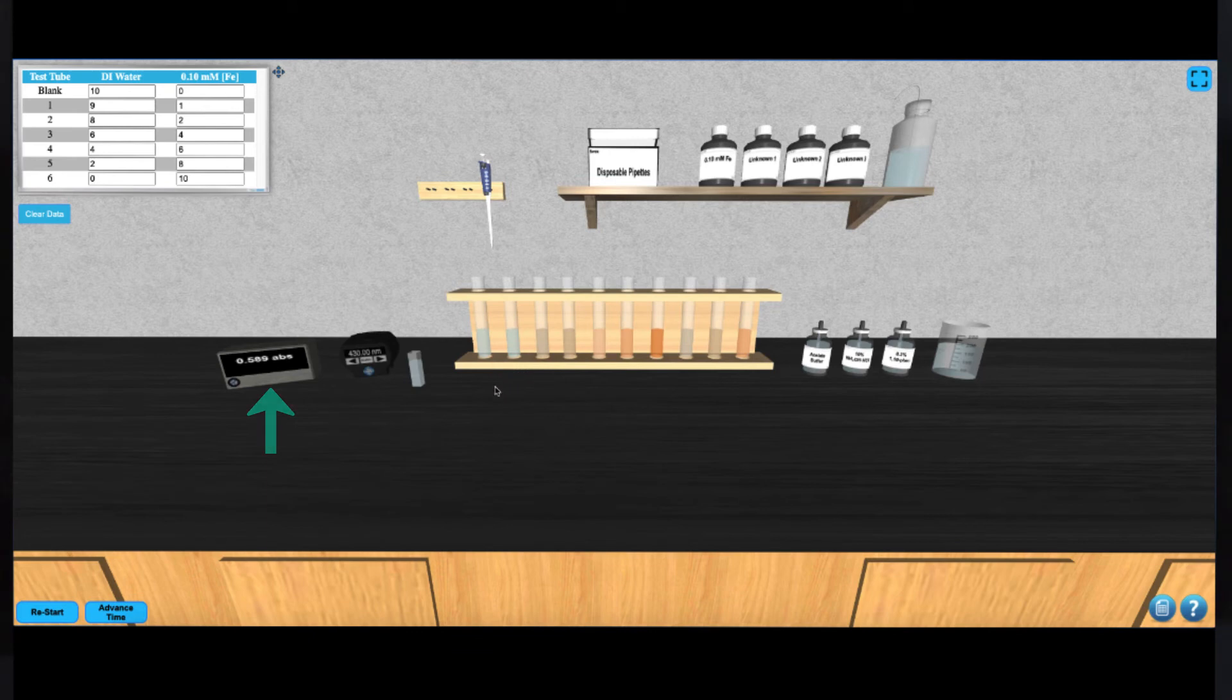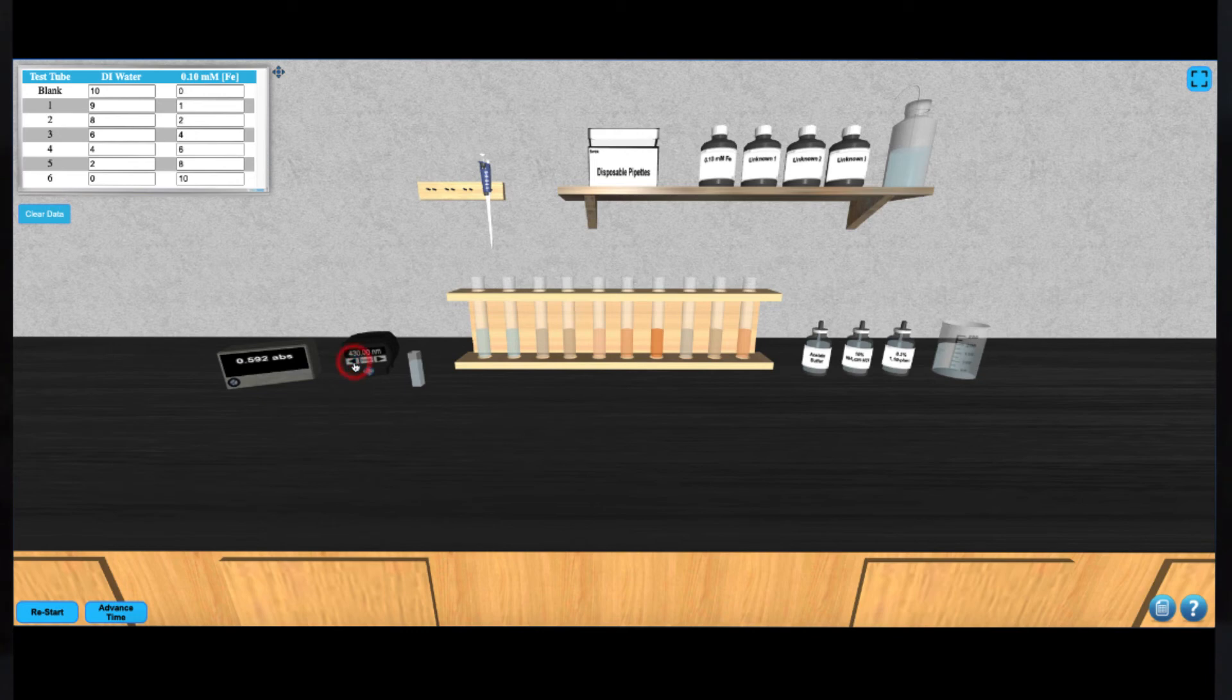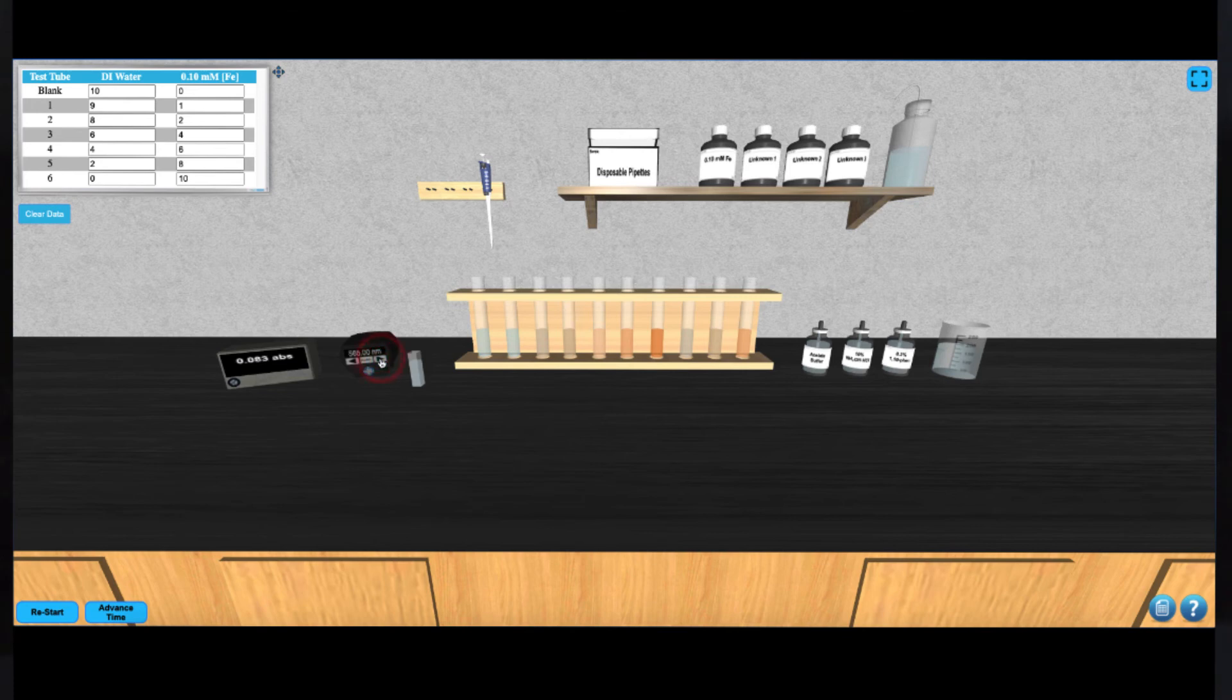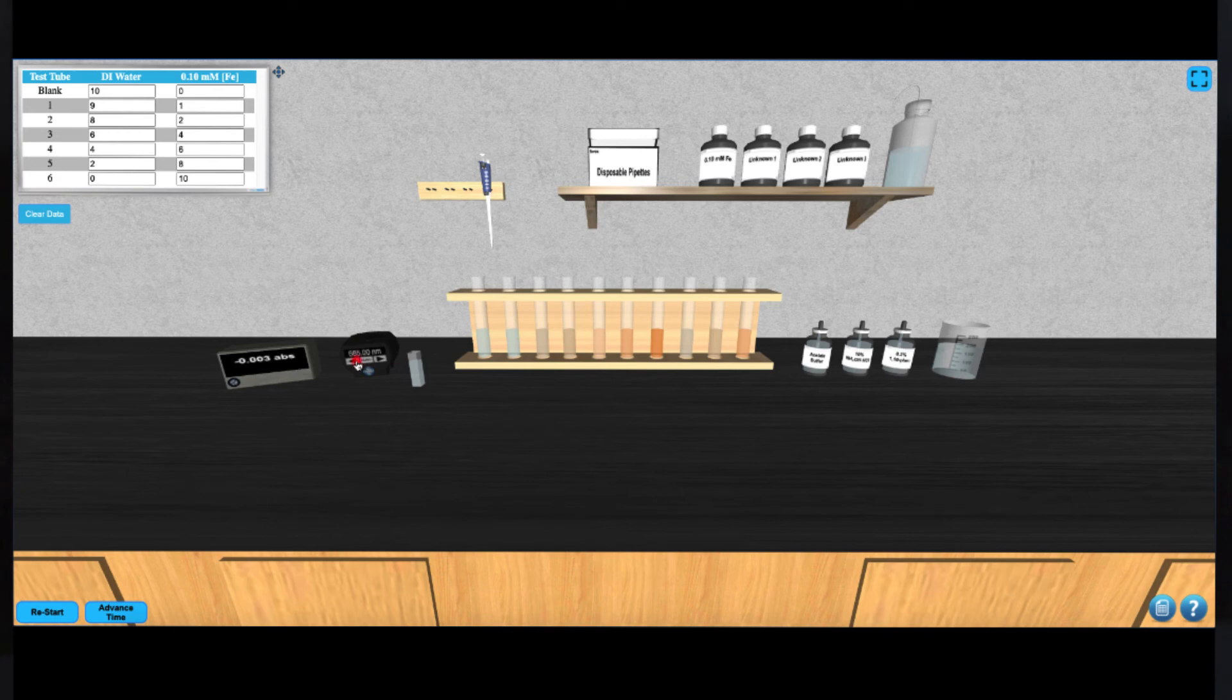To collect the absorbance reading for another wavelength, you just need to click on the arrow button on the front of the colorimeter. Take note of the new wavelength and the new absorbance reading. Repeat this for each of the four available wavelengths, and when you're finished, you can then select the optimal wavelength to use for the remainder of the experiment.